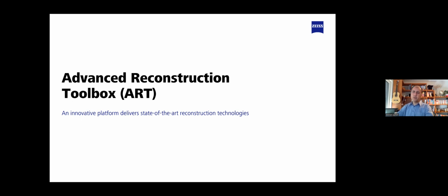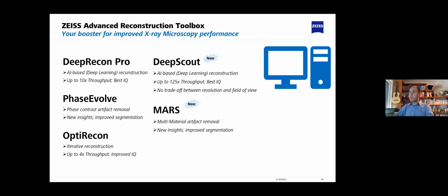There is also sometimes a need to just increase the image quality. As the scan time is not a problem, for example, we can just devote the needed scan time, but in principle, we would like to take more out of the device and visualize features that are normally hard to visualize. In those cases, we are increasing the scan quality using AI-based reconstruction techniques. So we have developed reconstruction algorithms based on artificial intelligence that focus more on the feature, using some algorithms that are actually developed by us here. And as I said, the goal will be either to increase the image quality, or to keep the image quality while reducing the scan time up to a factor of 10.